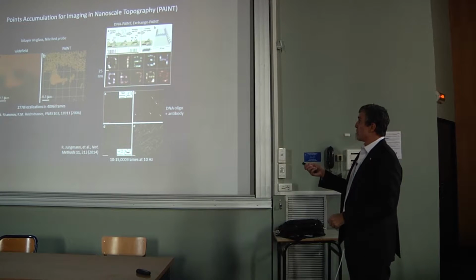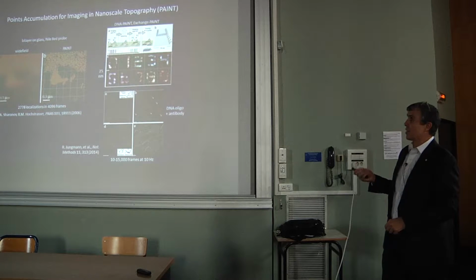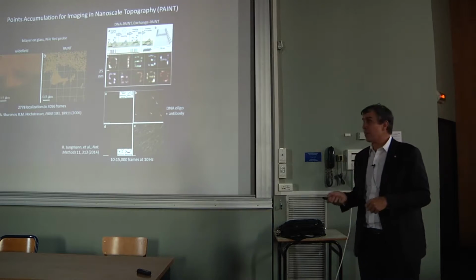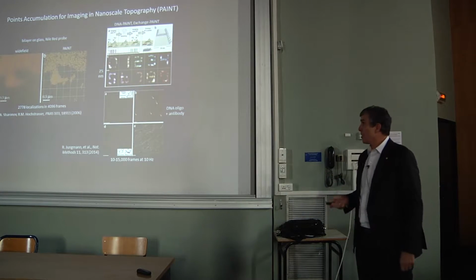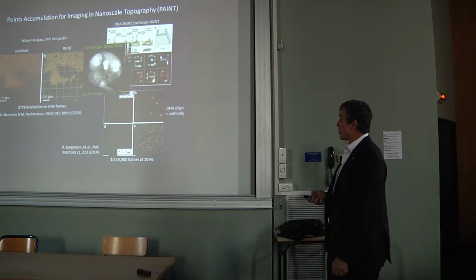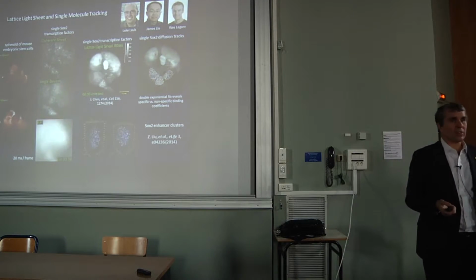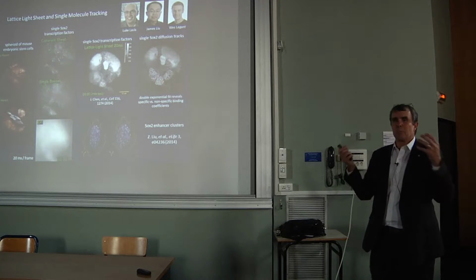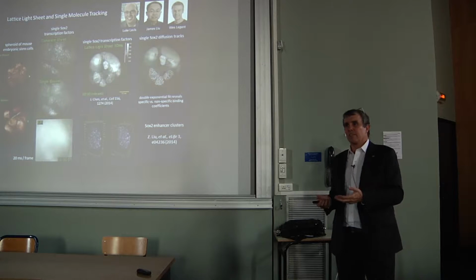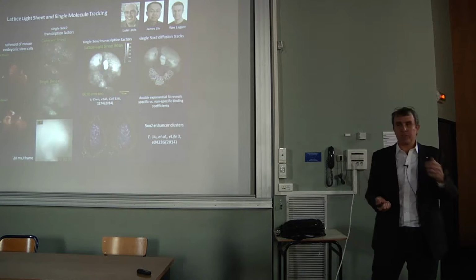That's been used to great effect to look at, for example, DNA origami structures with DNA oligos that transiently bind to complementary pairs within these origami structures. But it's difficult to do this normally in high density in whole cells. The problem is that the media itself is fluorescent, and it creates so much background that you can't see single molecules on top of all of the other out-of-focus molecules that are also glowing.